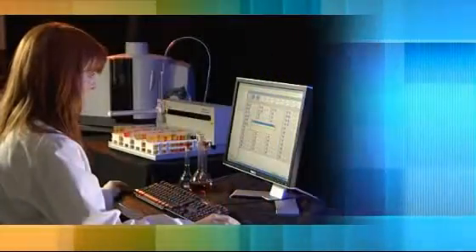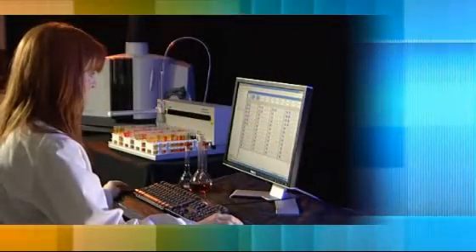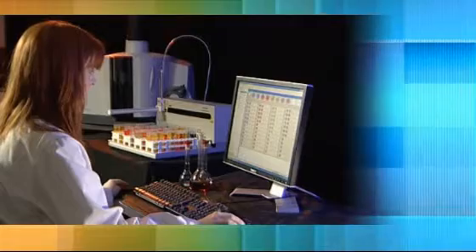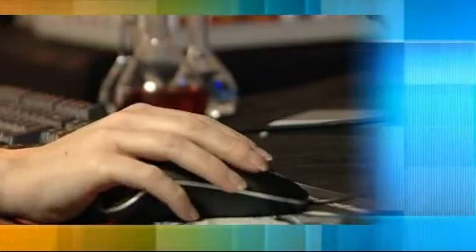The ease of use and flexibility of autosampler setup and sample list handling are critical to high throughput laboratories.